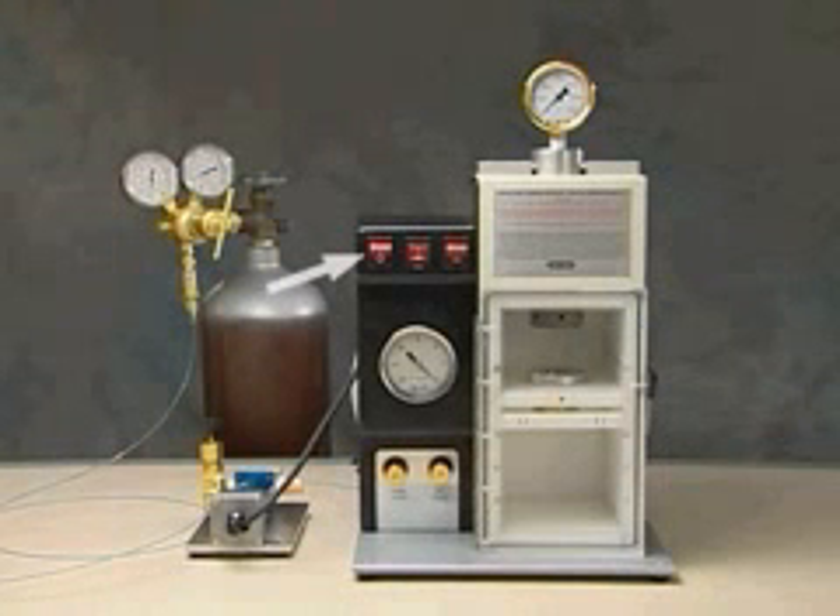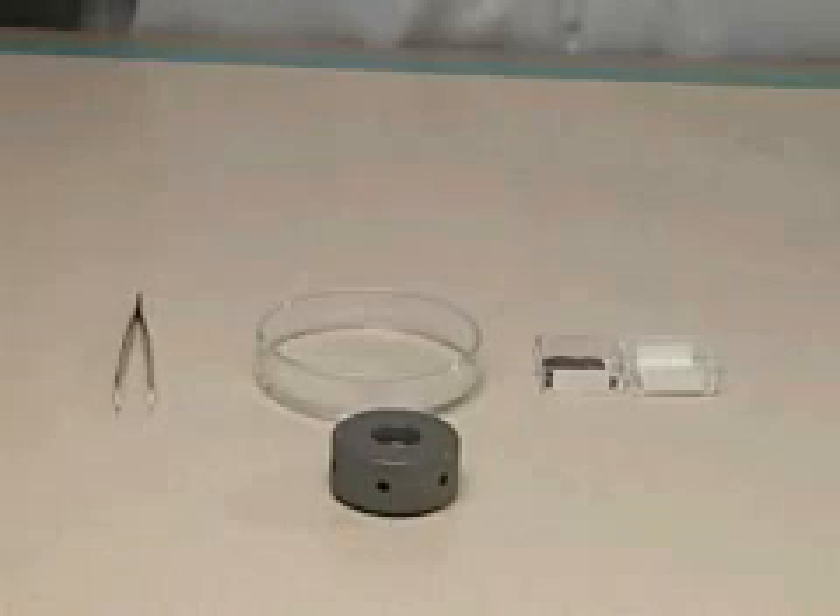Switch on the unit using the on-off switch on the control panel. Select a rupture disc of the desired burst pressure using sterile forceps.